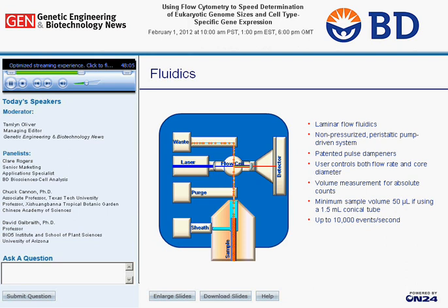That doesn't matter. You don't have to buy a particular tube. You can also use conical Eppendorf tubes, 1.5 mL size or even 0.5 mL size if you have very small sample volumes. You can go down as low as 50 microliters in the bottom of a conical tube. The system can go up to speeds of 10,000 events per second if desired. That would not be typical for DNA or cell cycle analysis, but one can do that.